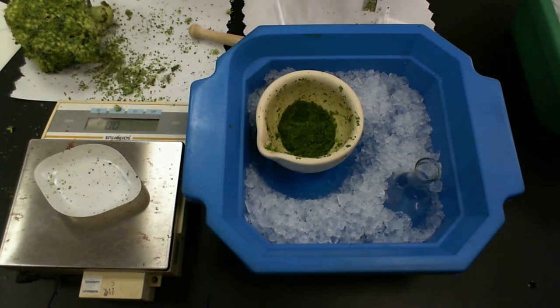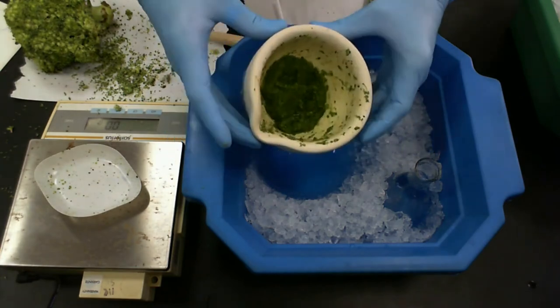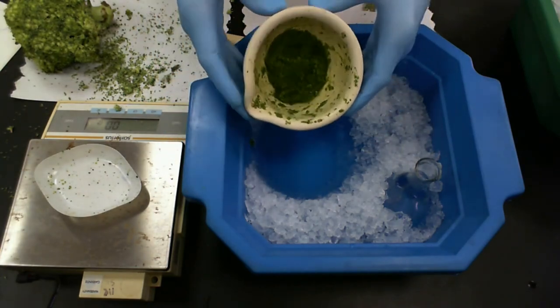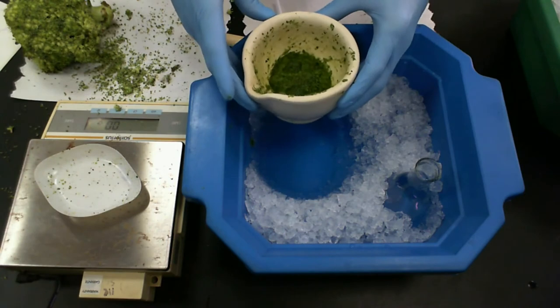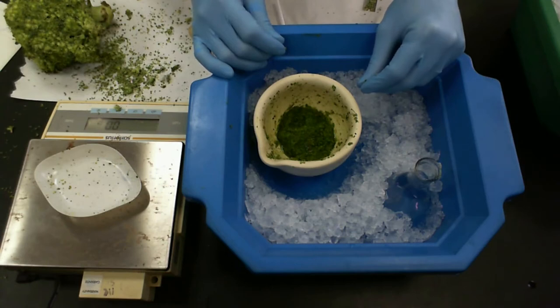So now we have our ground up tissue. So this is our slurry that's in here. You can see just basically a green soup. It's a mush. That's not really the technical term, but it's basically just this ground up tissue.